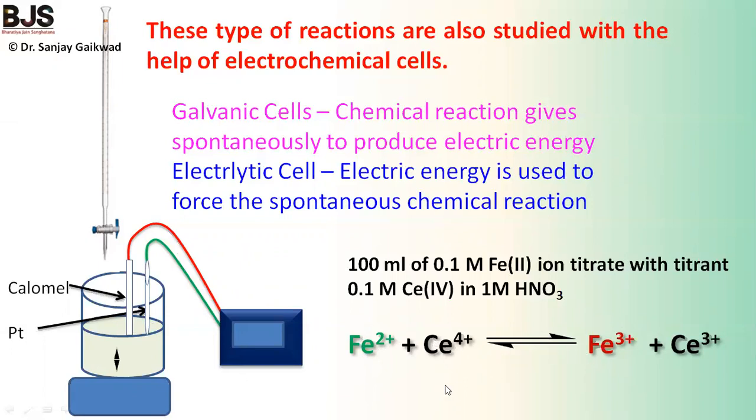In this way, the green solution gets converted into colorless. In this way, the oxidation reaction and reduction reaction take place simultaneously, therefore it is called a redox reaction.